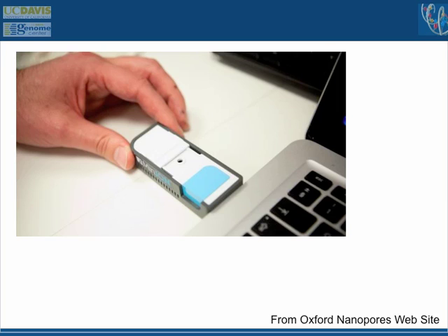Because even the Illumina MiSeq machine is $150,000. The Ion Torrent is $90,000. And again, for each of those, you need another $200,000 in equipment to really make libraries well. But $1,000 that is completely self-contained, disposable, high-throughput DNA sequencer. Pretty amazing.